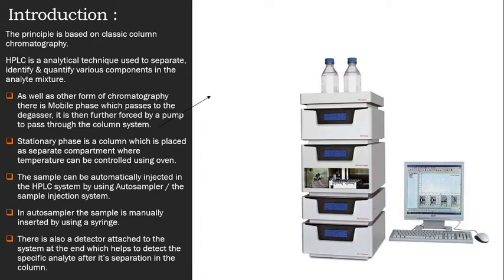So, from the examiner's point of view, we usually draw block diagrams to explain this instrumentation part because it's the simplest and easiest way. But like me, have you ever thought how this analytical instrumentation operates inside, or how a sample component separates out? This point will be explained to you today regarding the HPLC instrumentation with the help of some virtual diagrams for better understanding.